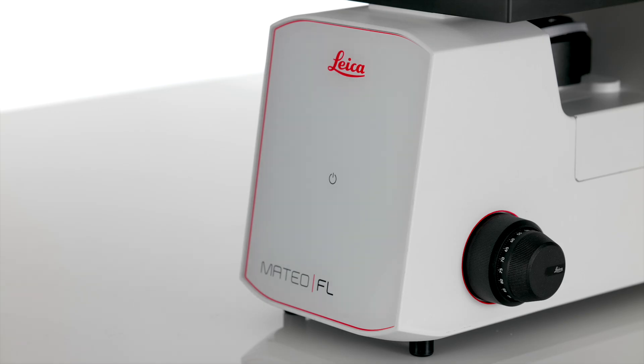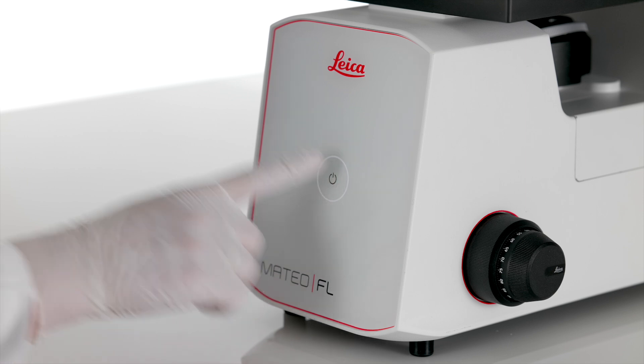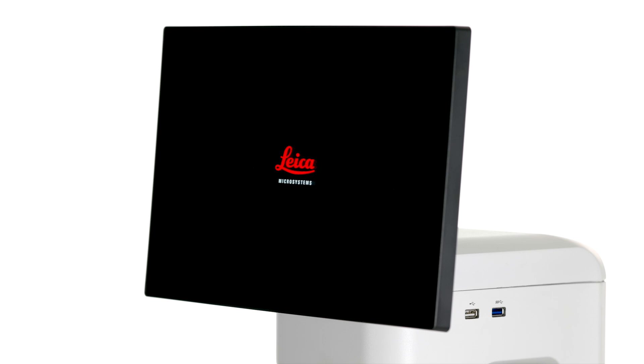After this first setup, all you have to do to turn Mateo FL on in the future is press down the power button located at the front of the instrument for five seconds. When Mateo FL powers up, you will see the main screen display appear.